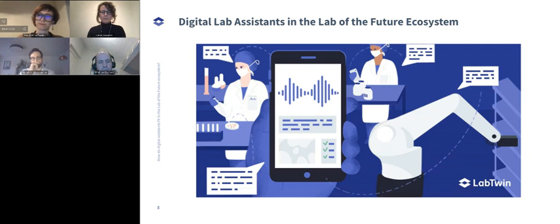A simple example I think I gave earlier was, was this reagent stored properly, or is this machine calibrated? Or as I'm sure everyone knows, as someone in the lab, you want to know who used this machine before you, because you kind of know that if Dave used this machine before me, then there's a good chance he broke it, or he left it dirty. And there are always situations like that where knowing an actionable piece of data can help you make a decision one way or another. So that's one. The other is a way of determining unknown unknowns.